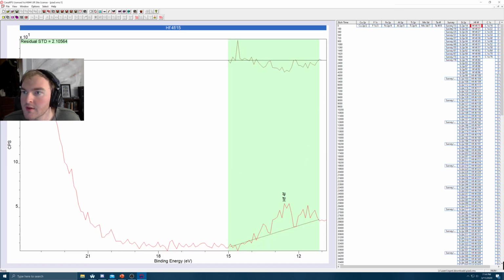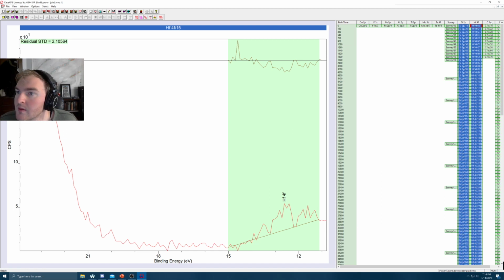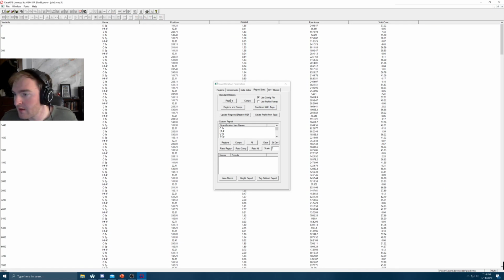Alright. So we have to highlight these first. So we've got our 4 columns highlighted. Now go to here, report spec. Yeah, so now you see these columns are highlighted, standard deviations, etc., etc. So now if we do regions, now we've got a table generated which can be exported to a text editor like Microsoft Word or directly to Excel.